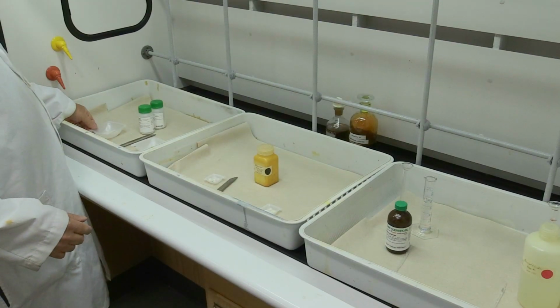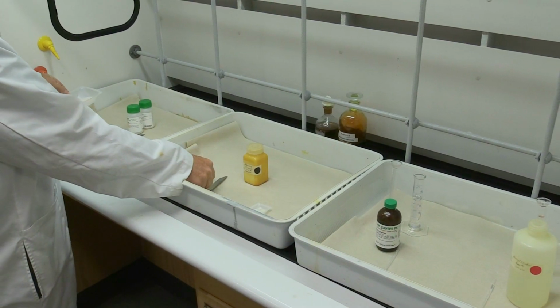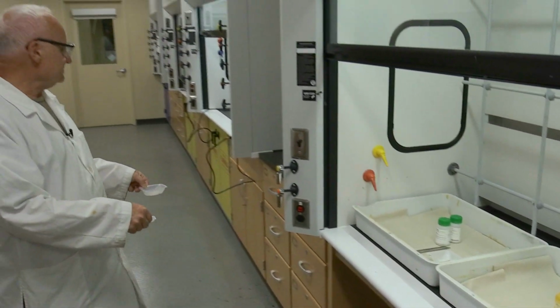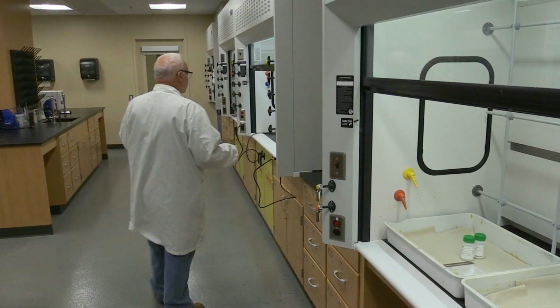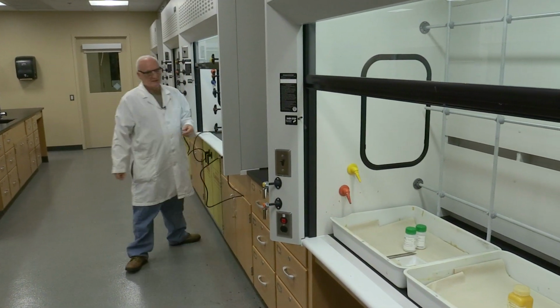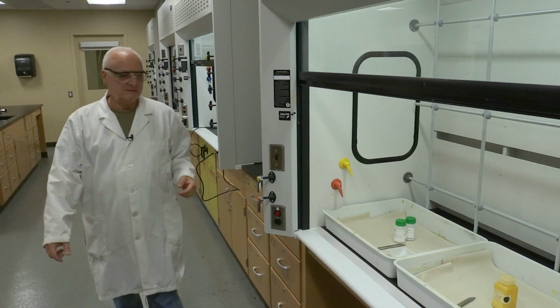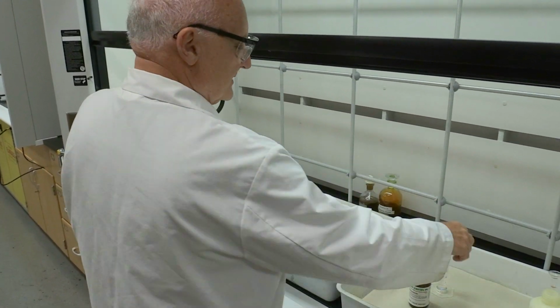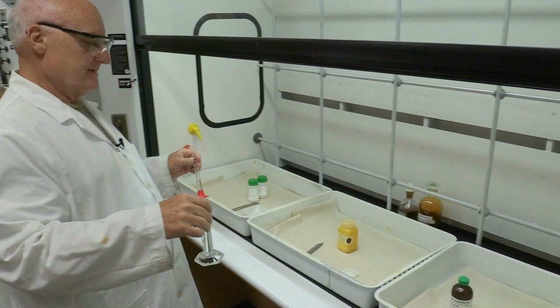I have the chemicals for the reaction pre-measured, pre-weighed, and we're going to set up over here with the reflux apparatus. And I have my 2 liquids measured.